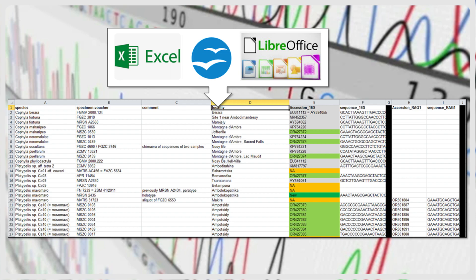By entering your sequences into a spreadsheet, you can easily sort sequences according to different criteria, look for duplicates, that is, sequences from the same sample, and easily get an overview of samples and species that are included or missing from the dataset.